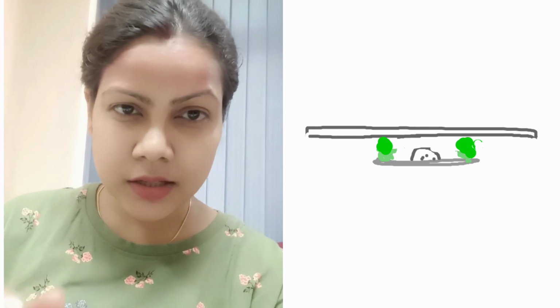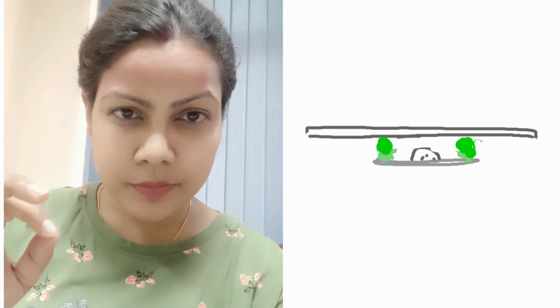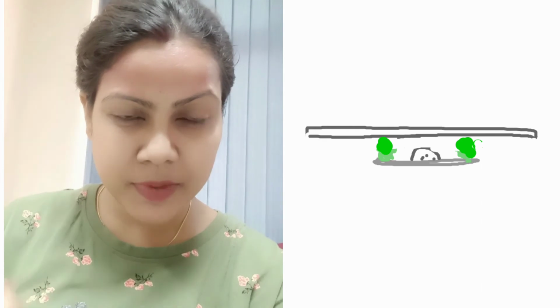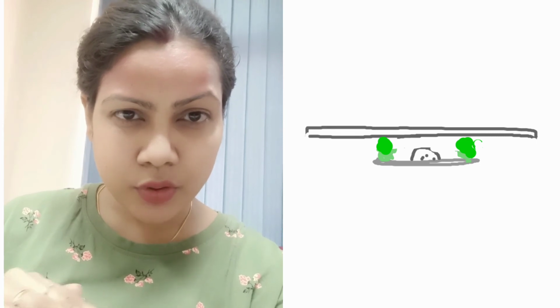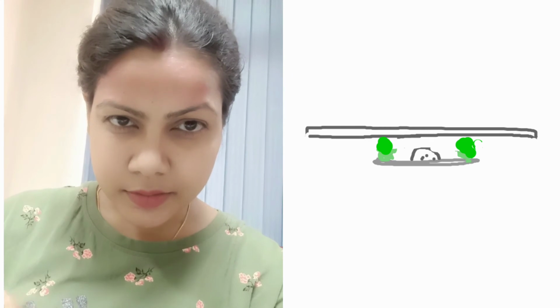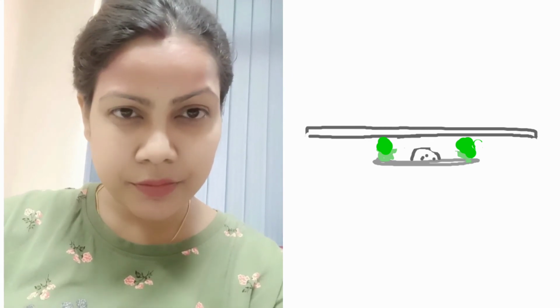After making the paraffin wax ring, placing a drop of bacterial suspension on the cover slip, and applying Vaseline, we place the slide over the cover slip and turn it in front of you.